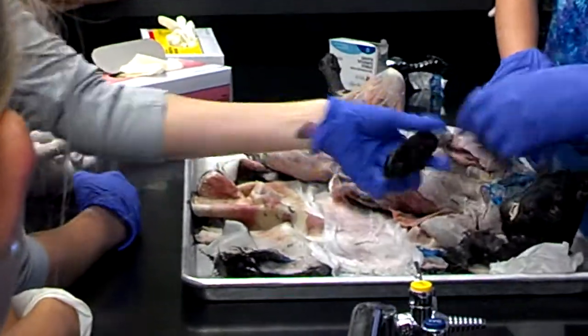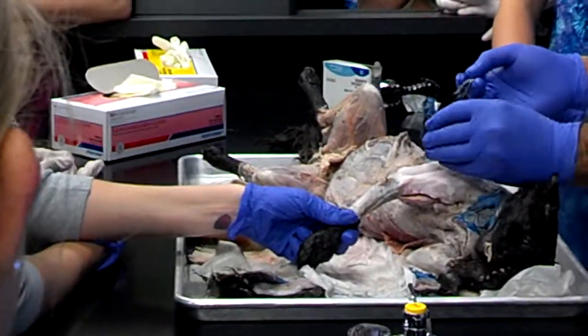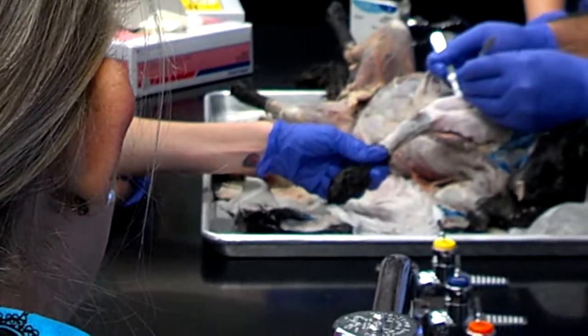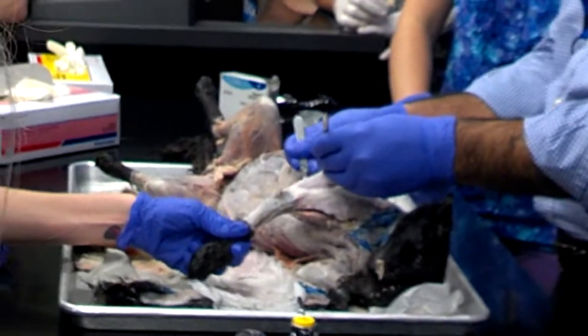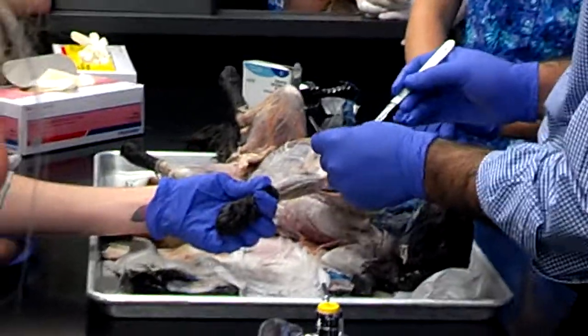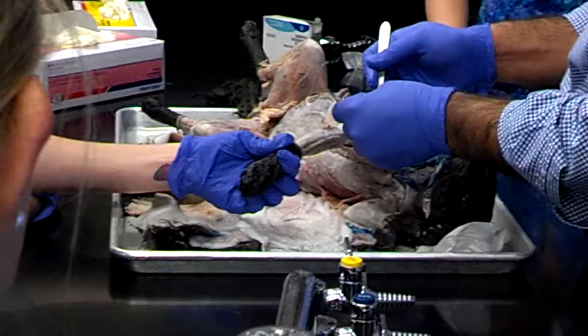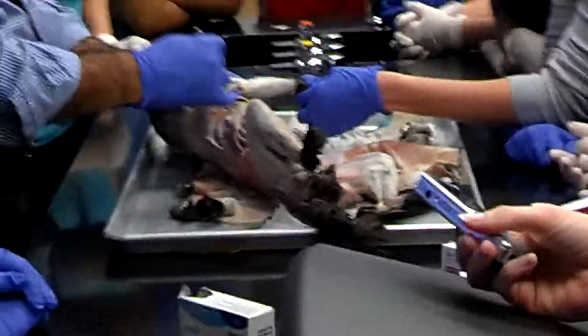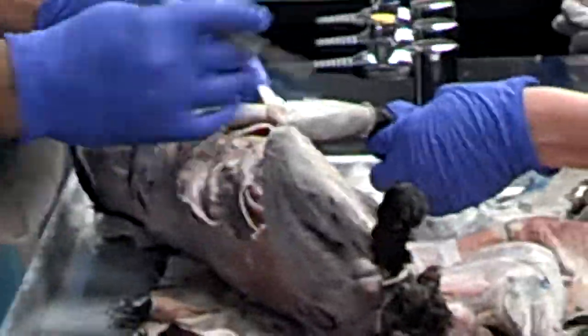Let me hold this. So you have to separate it from the underlying tissue. Just lift it up. Use the back side of your scalpel. See how I'm separating it? Right there. And from here too. Just lift it up. Right from there. This is your lateral head of triceps, right? And if you cut that and reflect it, underneath that is your medial head of triceps. So this is your medial head of triceps.